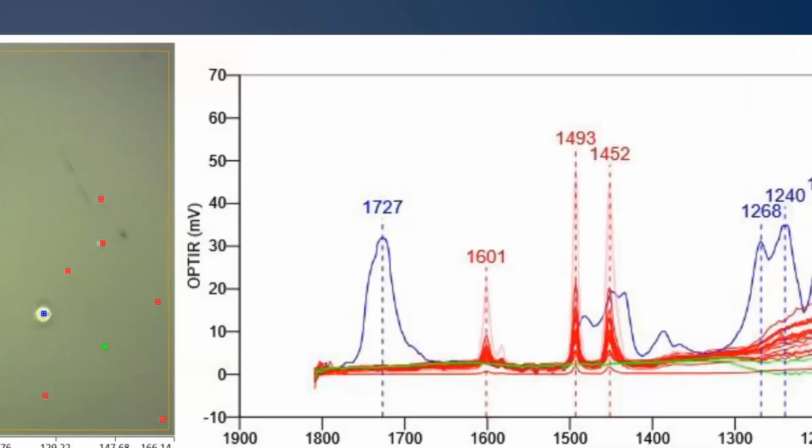We also played around with some of the modes, such as transmission, to see if we could get some good signal from that. We actually got pretty good signal, and we also did some mapping to see if we could isolate the different modes. You'll see 2 different modes mapped here, 1600 as well as 1730, which were present in the previous spectra, and they worked out quite well.